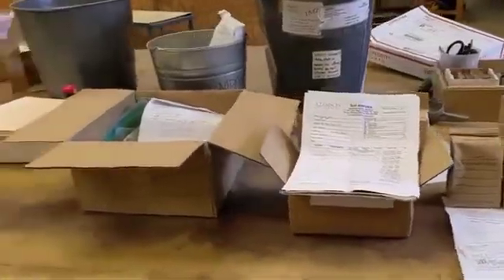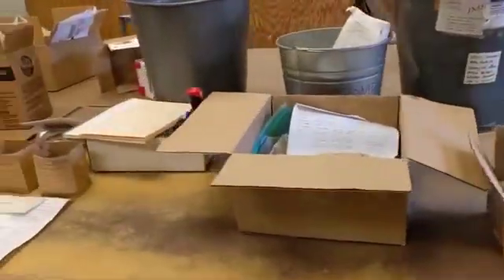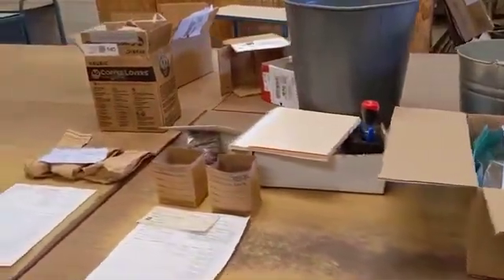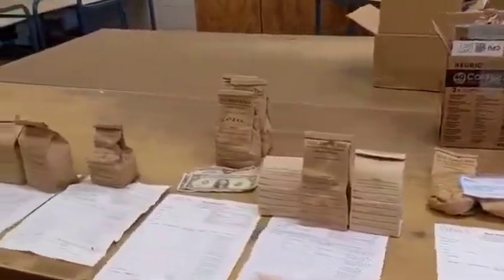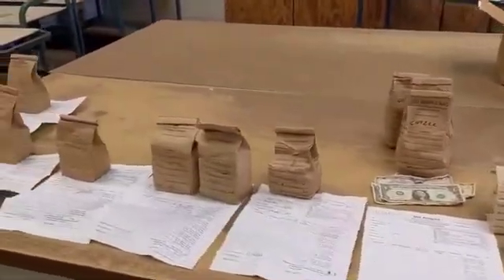When soil bags arrive at the lab, they must be sorted and matched with their paperwork. Each form is looked over to make sure it's filled out completely and accurately, and each sample goes into a set of 100 samples each.